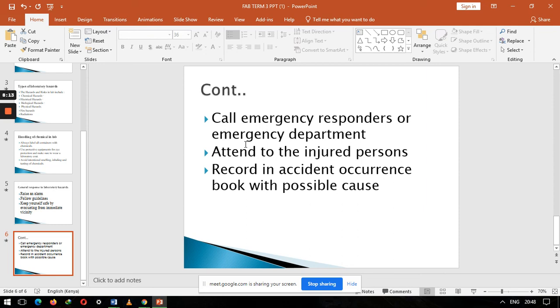The other response is call emergency responders. Thank you. Or the emergency department. Another one. Felicitas, kindly continue. You can as well attend to the injured person. Yes. Also, we can record in the accident occurrence book with possible causes. Thank you.